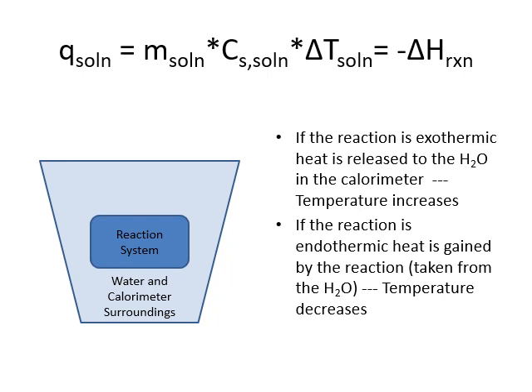To calculate the heat of our solution, we're going to be looking at the mass of our solution times the specific heat of the solution, which is 3.84 joules per gram degree Celsius. It's provided for you in your manual as well. And that is multiplied by the change in temperature, or the final temperature after we add our compound minus the initial temperature before we add the compound.